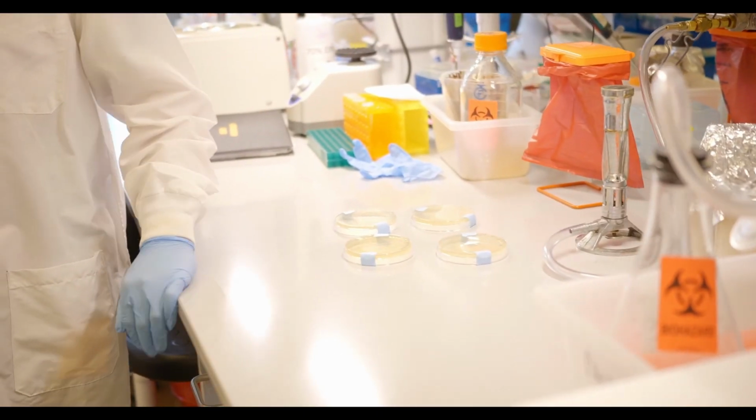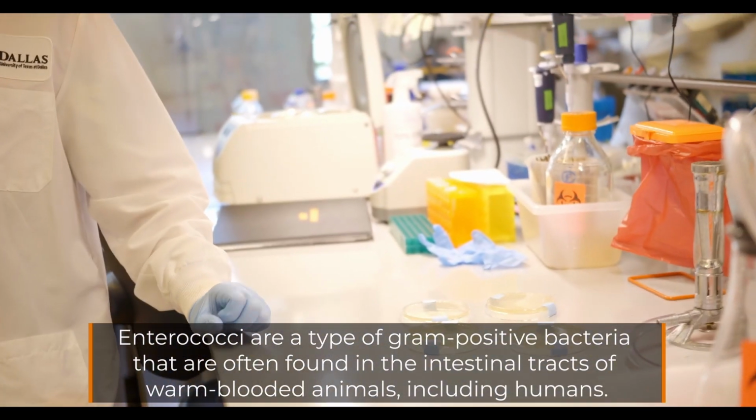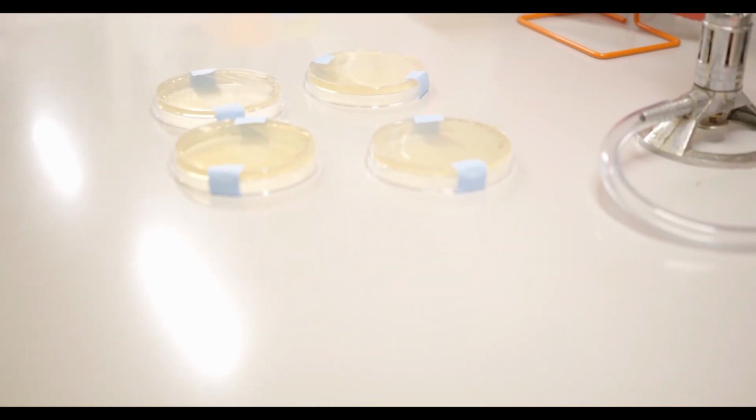And then we also have this project that I'm working on now in collaboration with a partner who's a PhD student here, as well as one of our collaborators up at Michigan, their medical school, where we are looking at these pairs of enterococci that were isolated from blood, and we're seeing how they became resistant to the antibiotic daptomycin. Can you illustrate what we're seeing in each one of these?